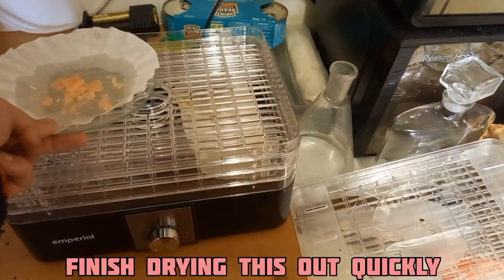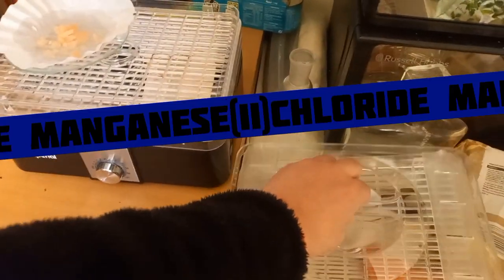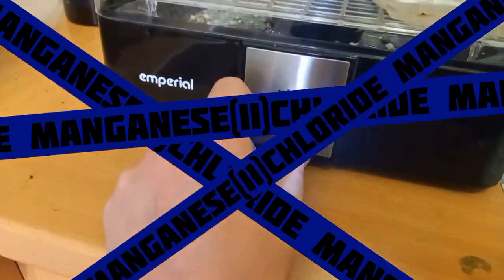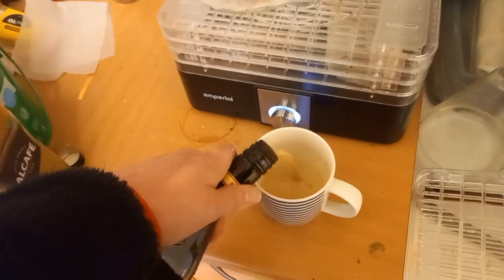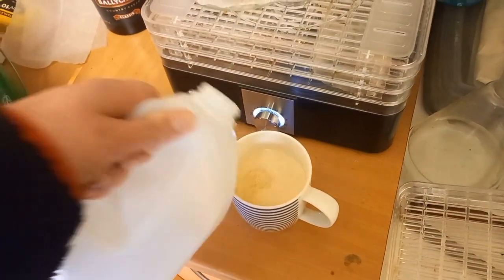I'll set this in here on a low temperature. I just love this stuff — we are allowed some indulgences.